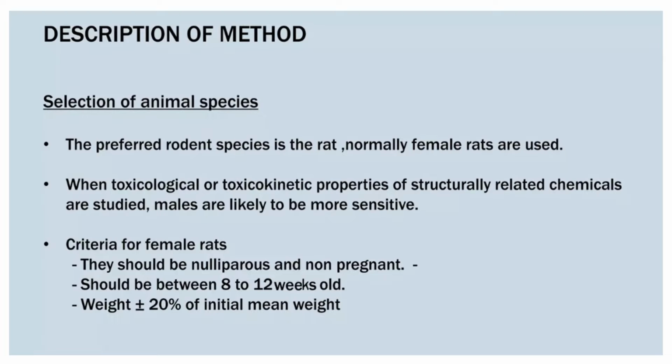Otherwise we have to use female, because females are preferred as more sensitive for this experiment. In some cases, if the drug is more sensitive in male rats, we have to write that in the report and we can use the male rat.